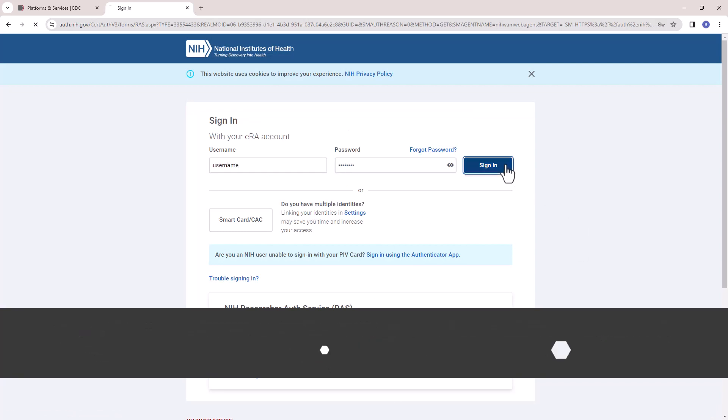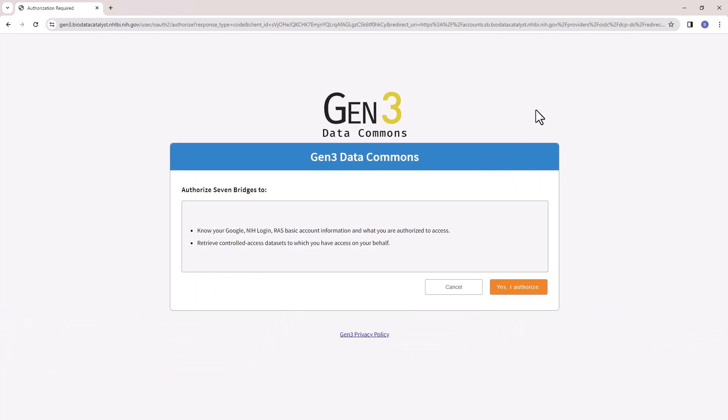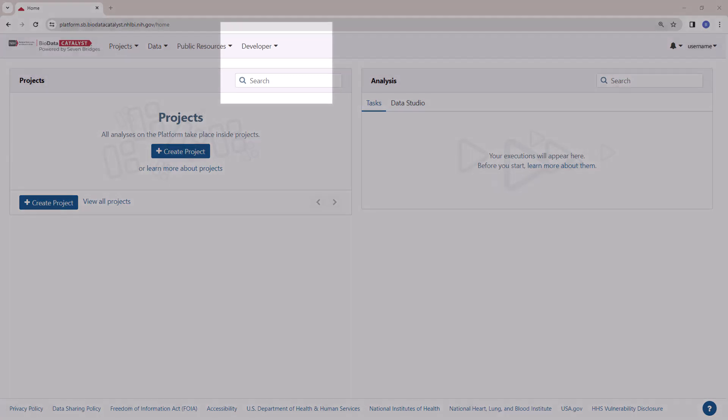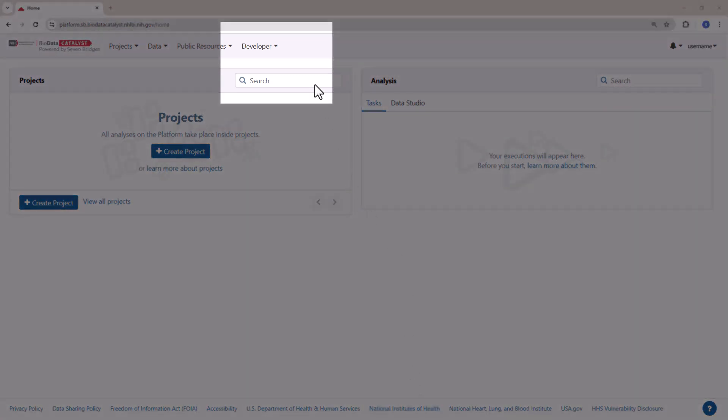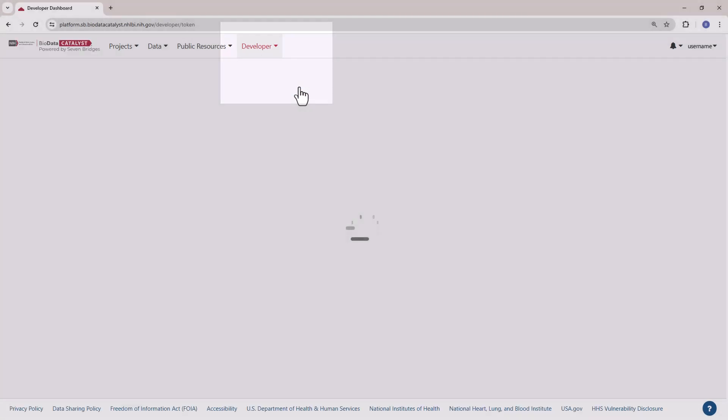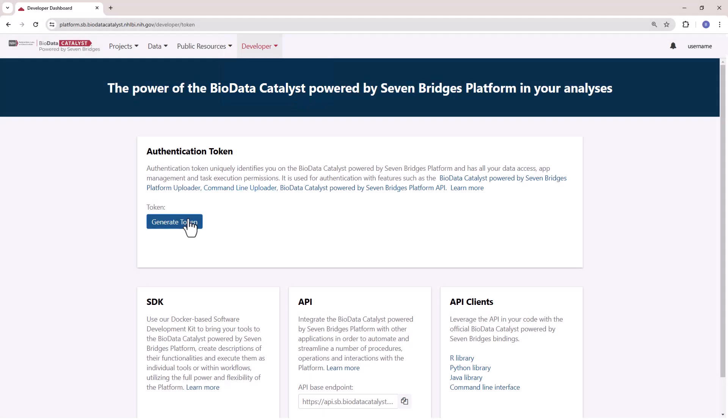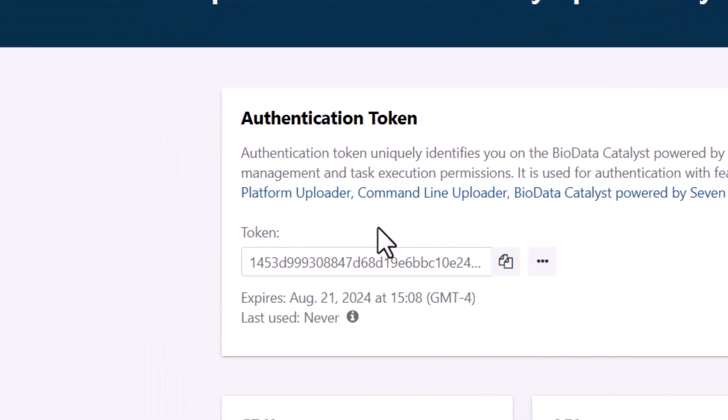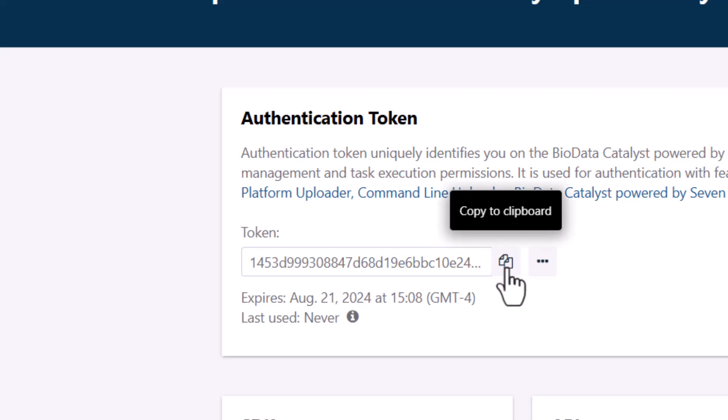Authorize BDC Seven Bridges to manage your access to controlled data. On the top navigation bar, select Developer and select Authentication Token from the dropdown options. Your authentication token is displayed here and can be copied using the Copy button to the right of the token.